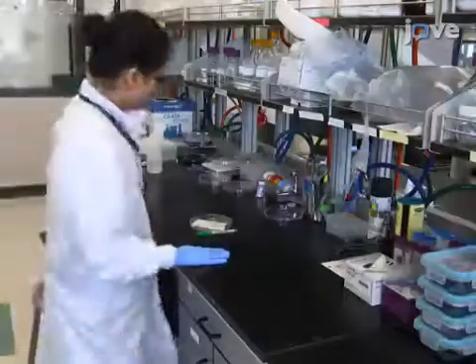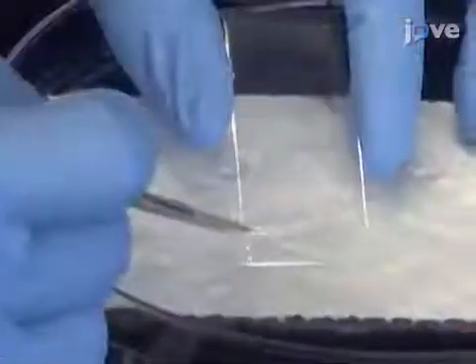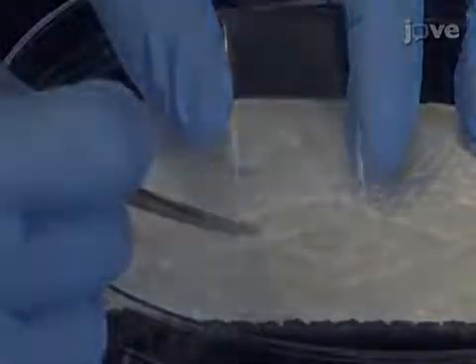The next day, measure the elastomer film's thicknesses. Use a razor blade to lift one edge of the elastomer film off the cover slip.